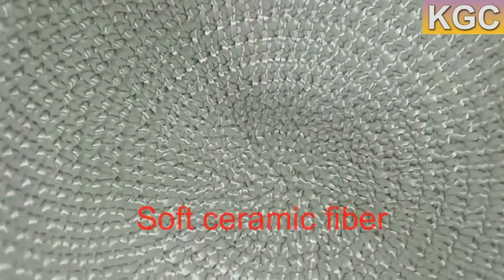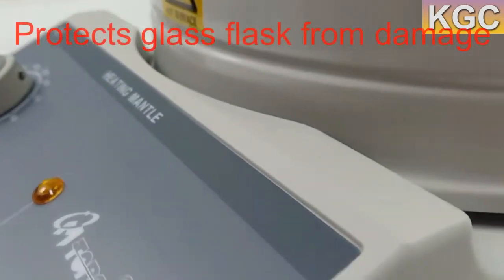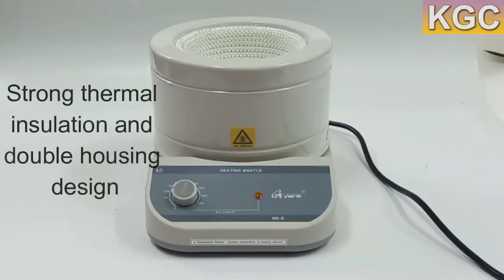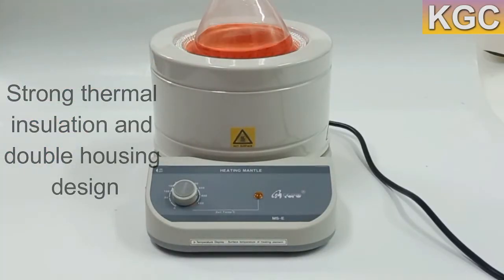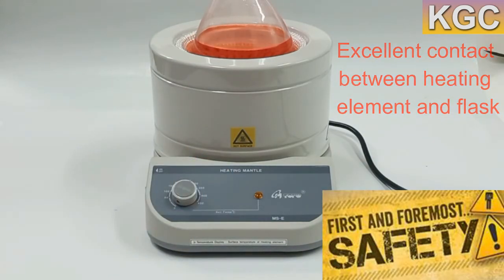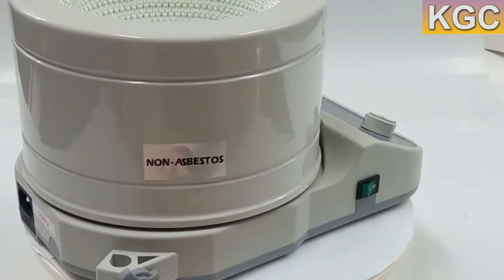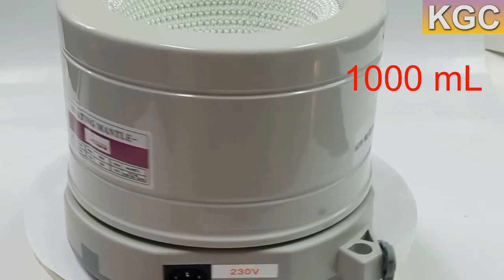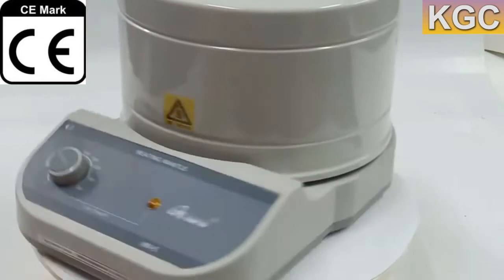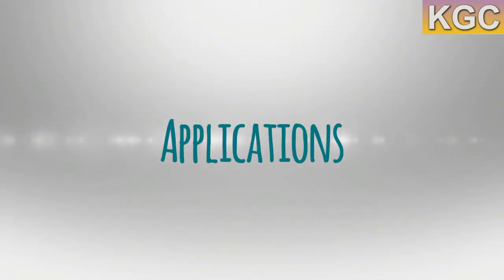The inner mantle part of the heating element consists of soft ceramic fiber, protecting the glass flask from damage. The soft fiber with strong thermal insulation and double housing design provides excellent contact between the heating element and flask. The fiber also maintains a low temperature on the mantle surface for user safety. The capacity of this model is 1000 milliliters.